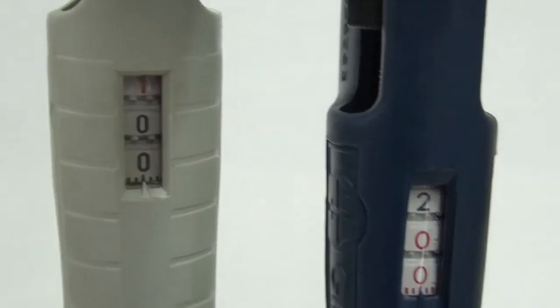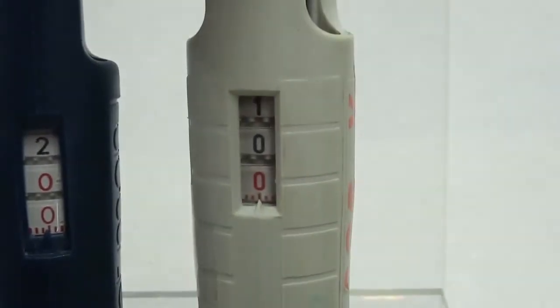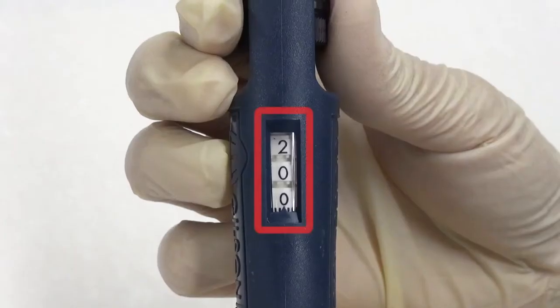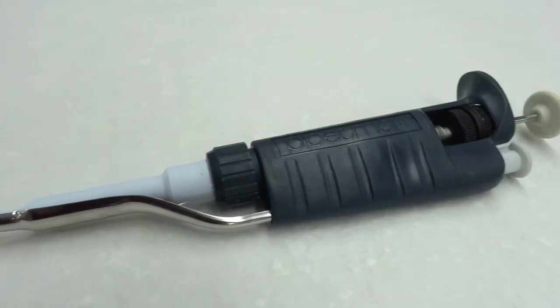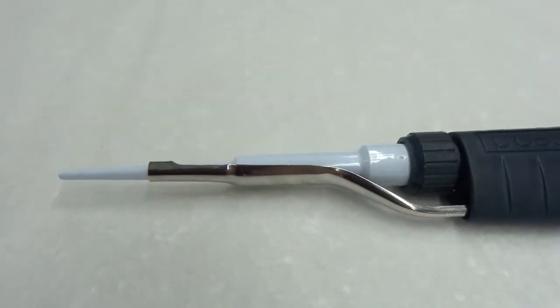There is a digital volume indicator at the middle to display the current aspiration volume. Note the scale of displayed digits. The tip cone at the lower end of the shaft can fit various types of disposable tips.